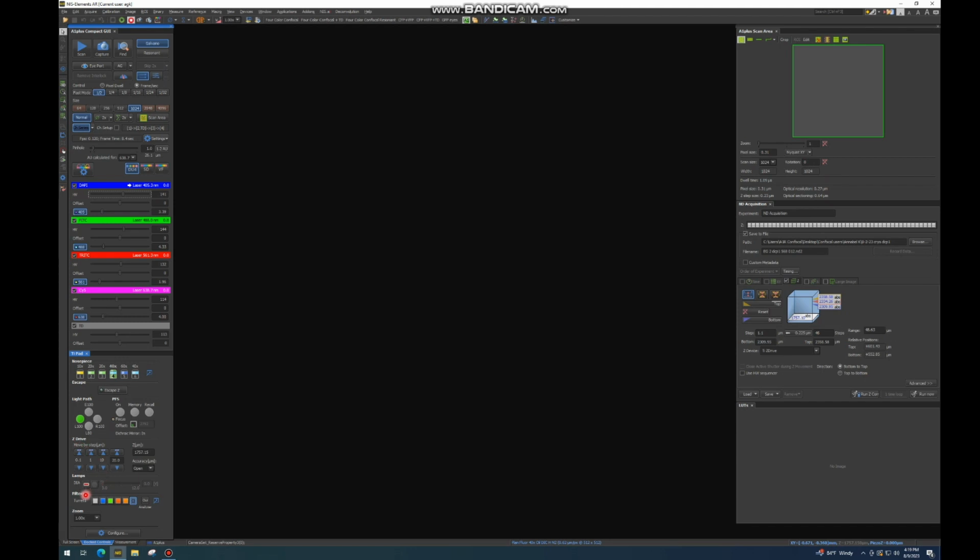Here we get onto filter cubes. So filter cubes are what you would click through when you're visualizing your sample through the eye port to see different channels of fluorescence. So we've got a bright field, a blue, a green, a red, and an orange. 647 is not visible to the human eye, which is why we can't have a filter cube for it.